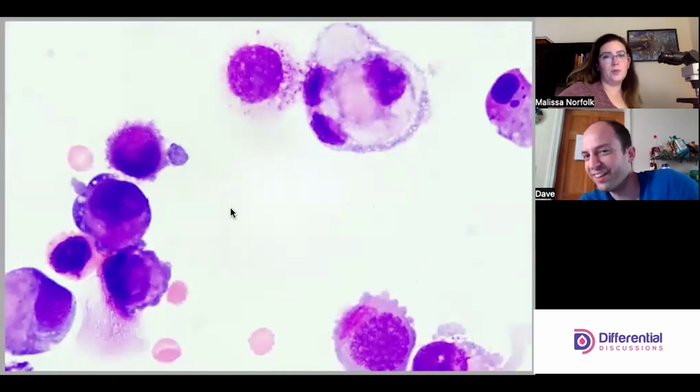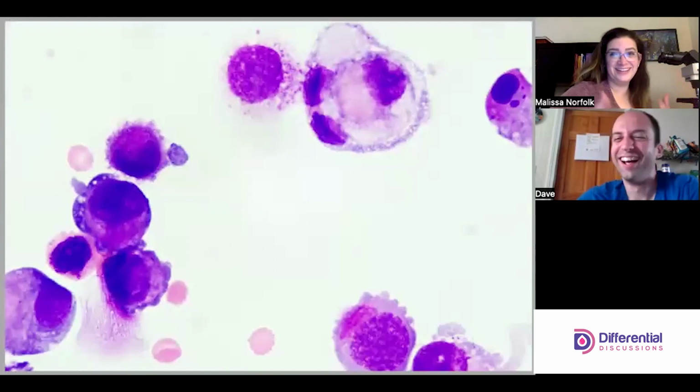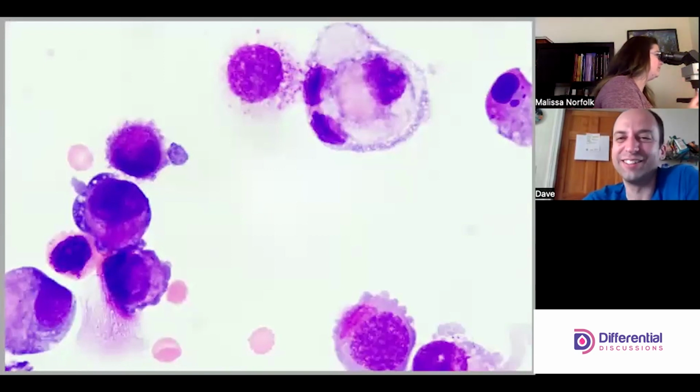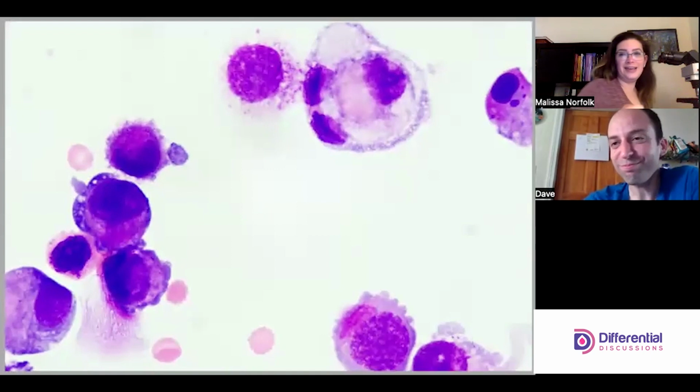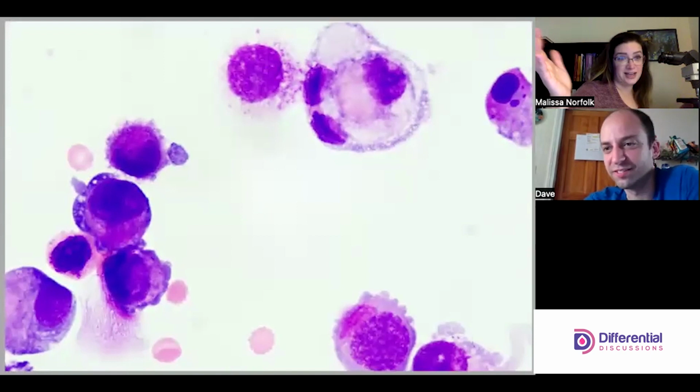This is the thing, we can't tell. Is it an actual normal macrophage doing its job, or is it a cancer cell eating another cancer cell? Oh man. And this cell is necrotizing, dying over there, which is usually the case, since cancer cells lose the ability to go through apoptosis, so they just die in circulation.